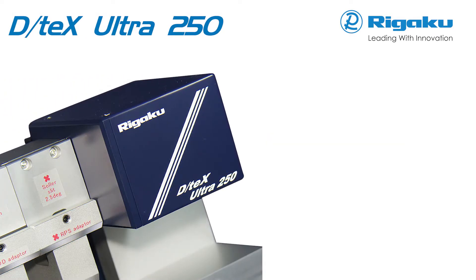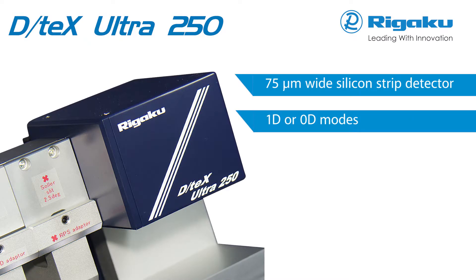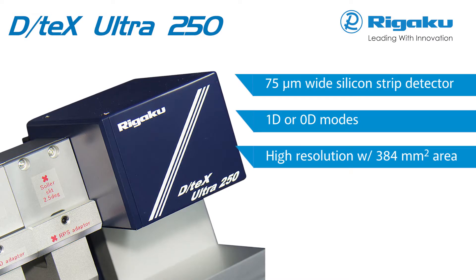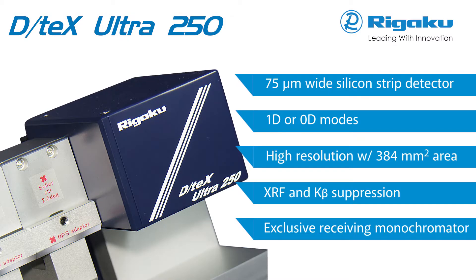250 times faster than a conventional detector, the DTEX Ultra is a 1D high-resolution silicon strip detector that offers XRF and K-beta suppression and an exclusive receiving monochromator for highest signal-to-noise performance.